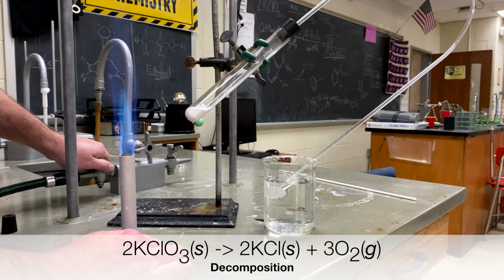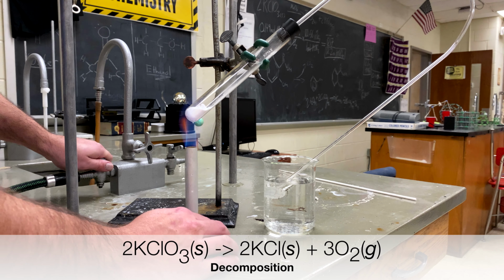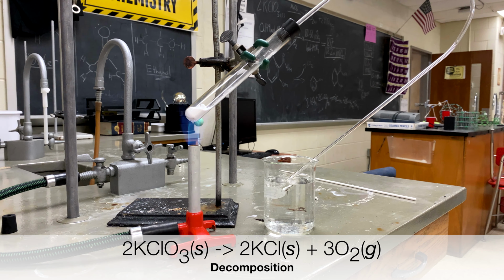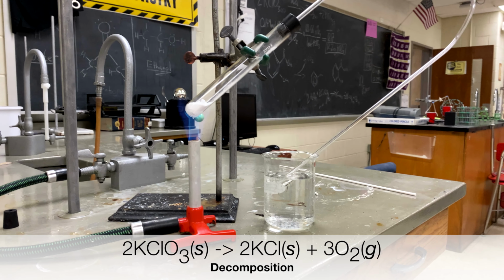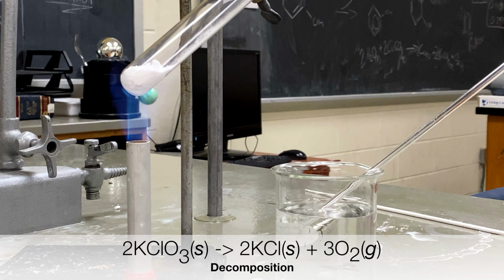The next type of reaction is the decomposition reaction. We can demonstrate this reaction when we heat potassium chlorate. When we heat potassium chlorate, it will decompose or break itself apart into solid potassium chloride, a salt, and oxygen gas. You can see that I've set up a test tube containing potassium chlorate, and it's stoppered off with a long tube that is then submerged into water.